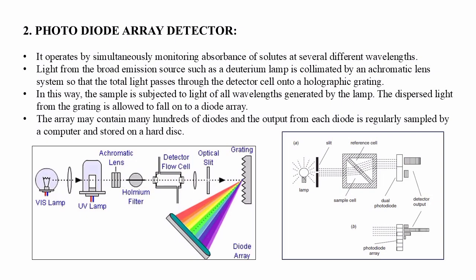It can analyze peak purity by comparing spectra within a peak and scan spectrum very quickly, provides single beam, and is useful for kinetic studies. It is also useful for qualitative and quantitative determination of the components exiting from a liquid chromatographic column. While its disadvantages are large noise because the amount of light is small.